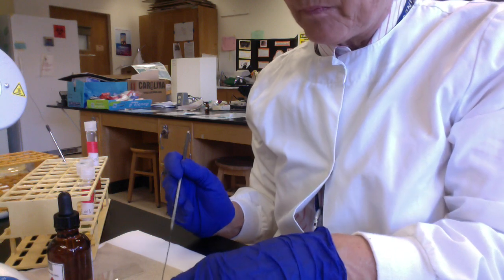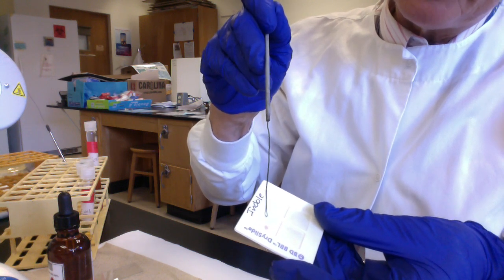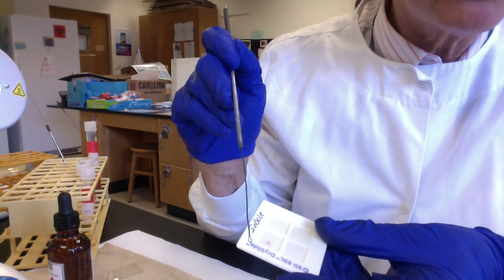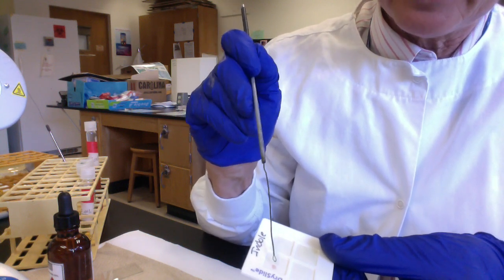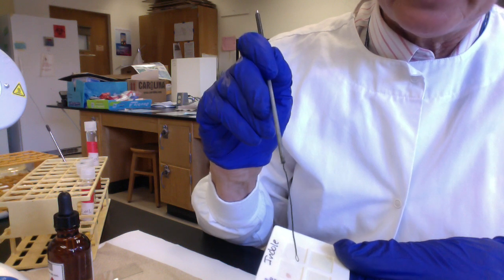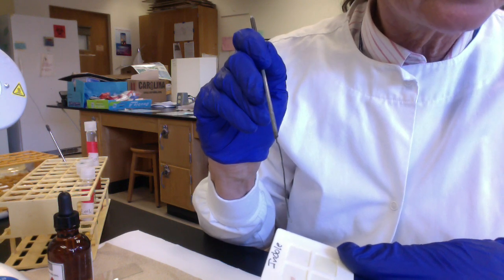And I'll hold this up here. So I'm just smearing my E. coli onto my indole dry slide. And check that out. You guys see it's turning pink or red. That's a positive indole test. And a positive indole test tells me that my E. coli makes tryptophanase, breaks down tryptophan, producing indole. And that's what these reagents detect. So red or pink is a positive indole. If I tried a different microbe and inoculated the indole dry slide and it didn't turn pink or red, that's a negative indole test, and it tells me my microbe doesn't make indole.